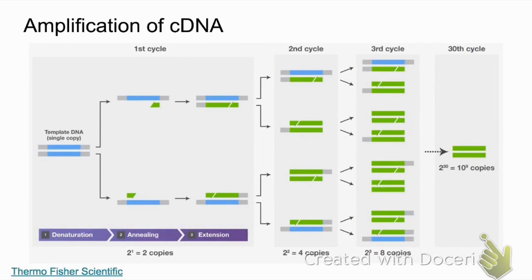This image here then is showing you a broad overview of this process of PCR. You can see that in the far left-hand side, they're showing you those first three steps that we talked about. The denaturation, which is heating the sample to 95 degrees Celsius to separate those two strands of DNA. The annealing, which allows the primer to bind to the template DNA, and then the extension or the polymerization step.